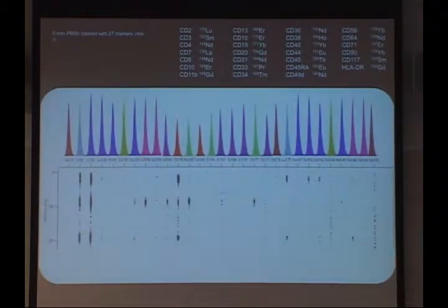So what this actually looks like when you're running the machine, and you guys again get to see this, so I'll just go through this really quickly, is what in our lab we call the rain. So there's not nice little dot plots that come up, unfortunately. We're still working on that, but you get this kind of qualitative readback where each column here is a different mass isotope reporter, and then each line is what they call a push number. So the mass cytometer is actually acquiring about 80,000 mass spectra per second. That's not 80,000 cells per second, that's 80,000 mass spectra.